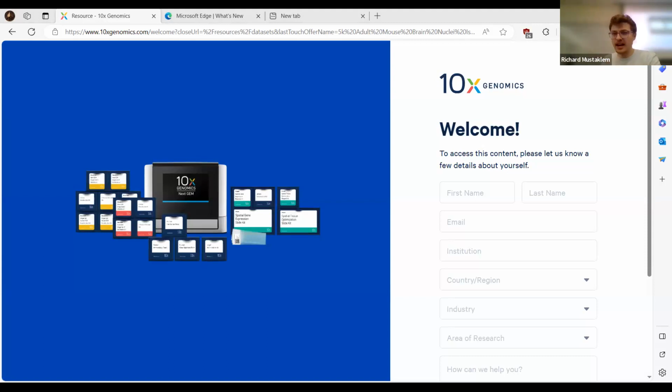So once you download that, it's going to give you a tar file. And did it give you a tar file? So what you can do to just quickly, H5. Okay, so try the cell matrix filtered. I'm sorry, I might have highlighted the wrong one. Can you try that one, Sadie? This bottom one? So that's the tar file. Okay, I'm sorry, guys. So this one here, let me move this down. So feature cell matrix filtered. This will give you a tar file.